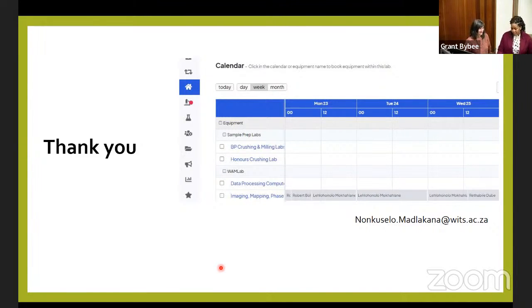It's actually the plan now. Especially when we tested with Rebecca's samples, to see that sometimes you need more, and also with the fly ash samples, where they wanted to compare with the XRF and the TIMA. I'm progressively improving the database. Okay, you can reach out to Nonku anytime. She's always welcoming new collaboration and new questions.